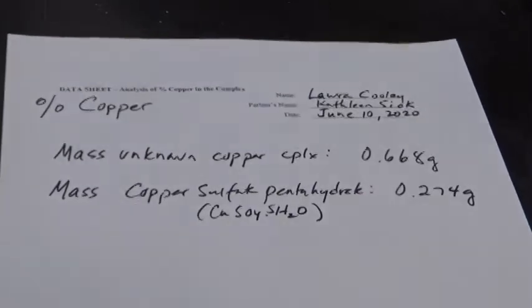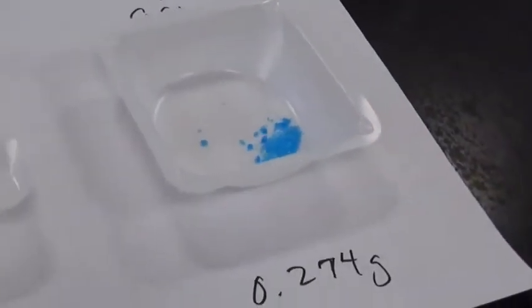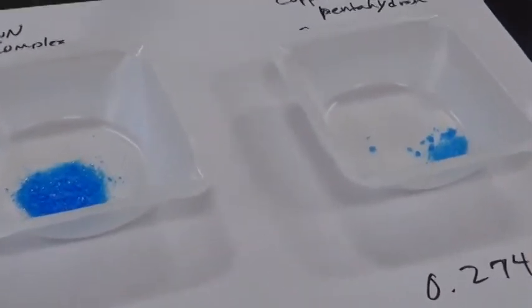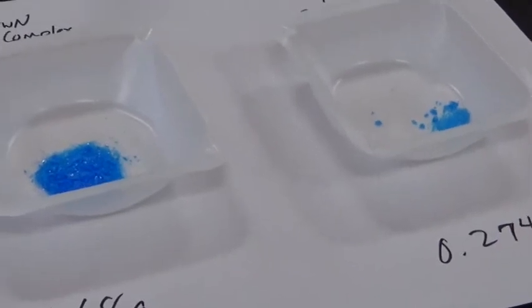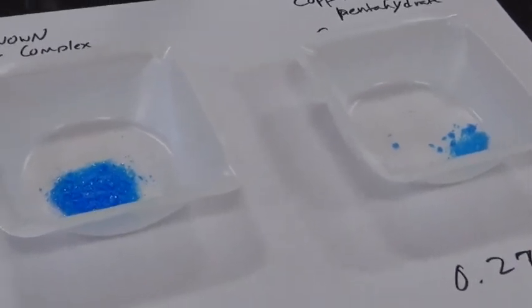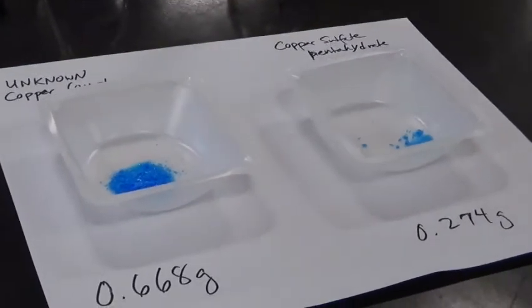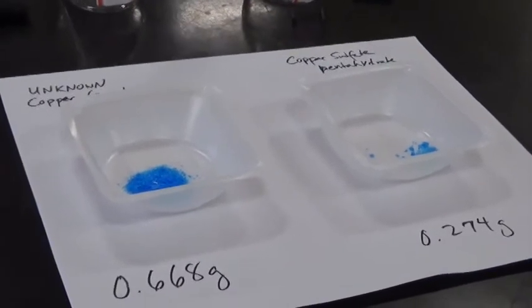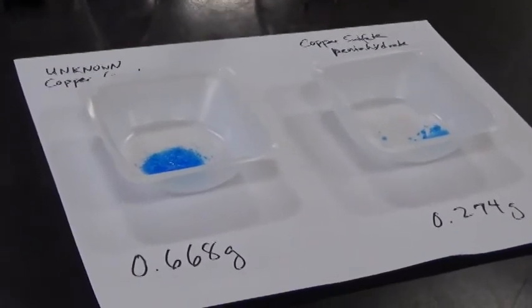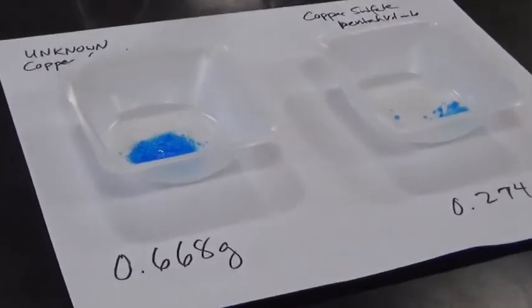And now Mrs. Syak is going to use these two samples to make up two solutions, one of the unknown in water and one of the known copper sulfate pentahydrate also in water, but both will have ammonia added to them. So she's going to add 15 mils of ammonia to each solution. And that's the first step in figuring out the percent copper in the complex.